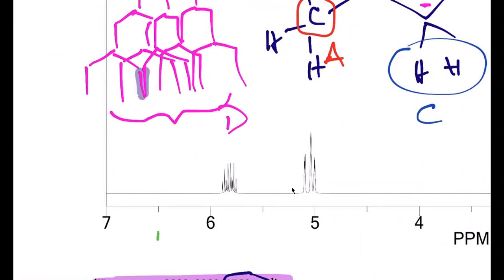If those 2 overlap, even though the signal should be a doublet for each one, that's only going to give you 1 line. So what I'm saying is, with the splitting tree, we expect to see 12 lines, but there's probably some overlap in the splitting tree. And so some of those lines are going to merge.